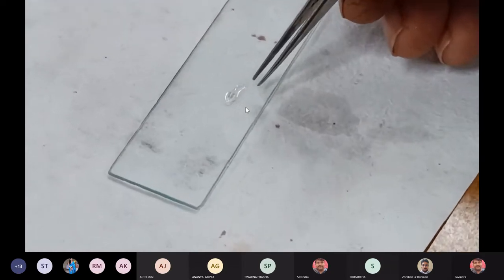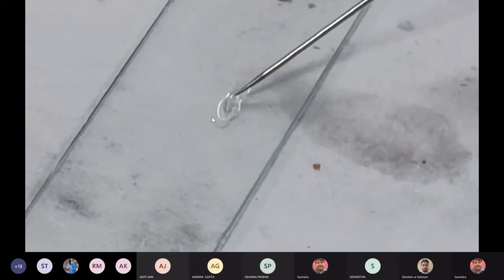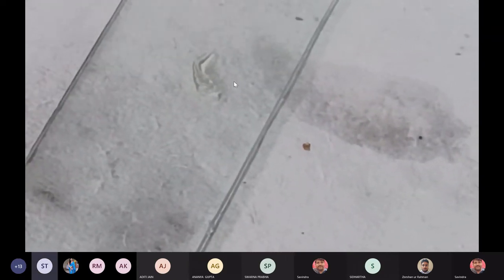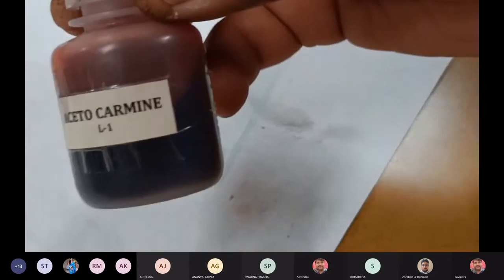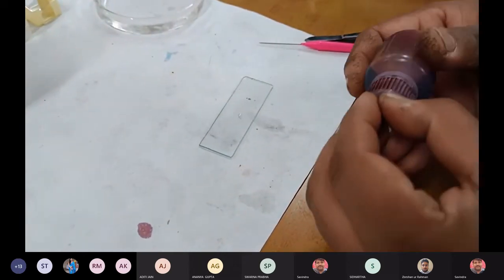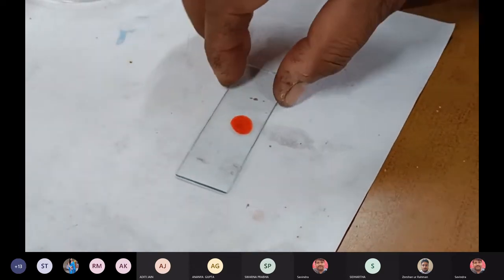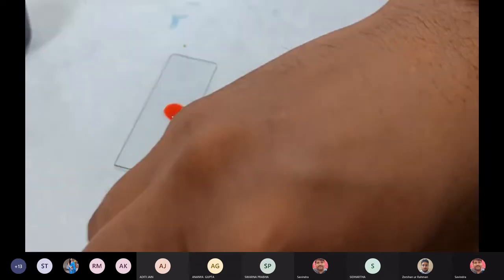This is the small part of the lateral branch. हो सकता है आपको भी ना दिखाई दे या दिखाई दे. You can enlarge it at your end. You can see there is a thread-like structure. Is it visible to everyone? Yes, sir. Okay. It will be more clear once we stain it. We are giving it a stain of acetocarmine, but why not iodine? सोचिएगा इसको, मैंने acetocarmine क्यों लिया है? So why acetocarmine? Why not iodine?